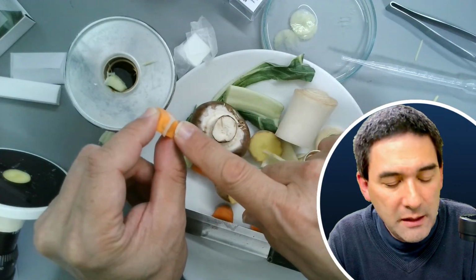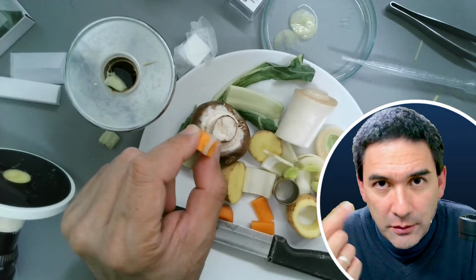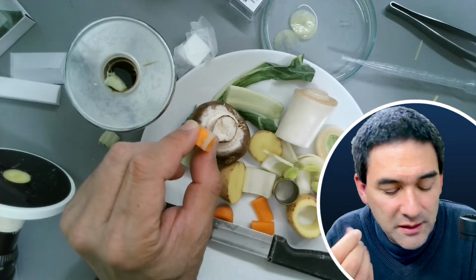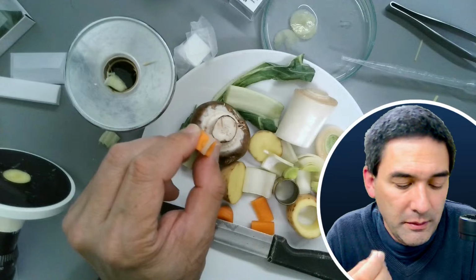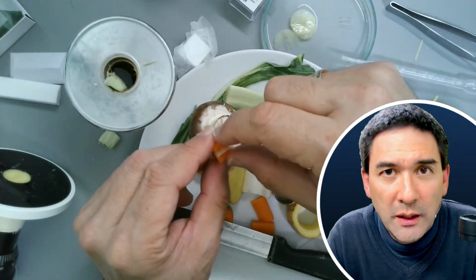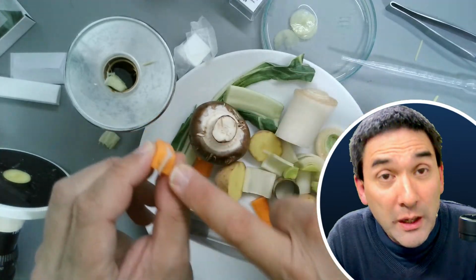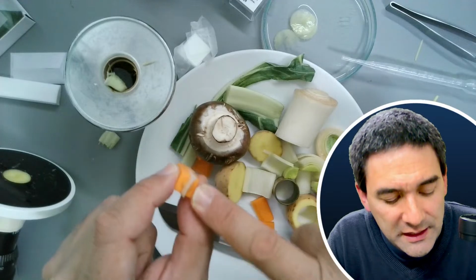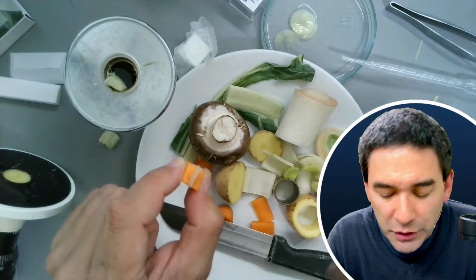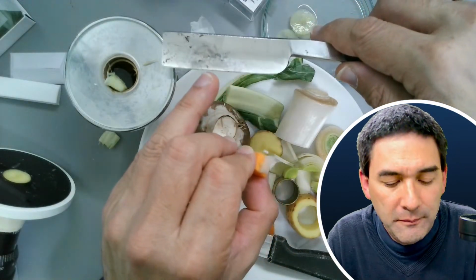People in the past have used elderberry. It's a plant, and the inside of the stem also contains something that almost looks like styrofoam, and you can use that as well. However, styrofoam is not recommended. I've tried it myself. The reason is that styrofoam is very bad for the edge of the knife.